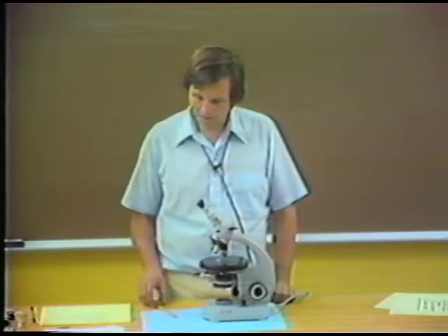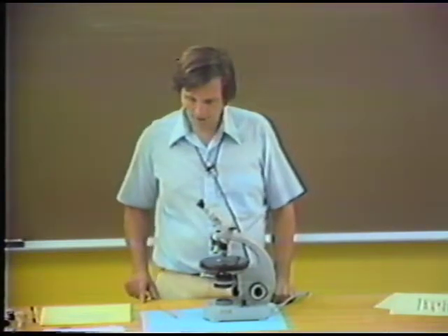Well, many isotropic crystals show cleavage as well, and cleavage is a very useful parameter that you can see in all kinds of minerals and should not be ignored if it's present as an identification criterion.